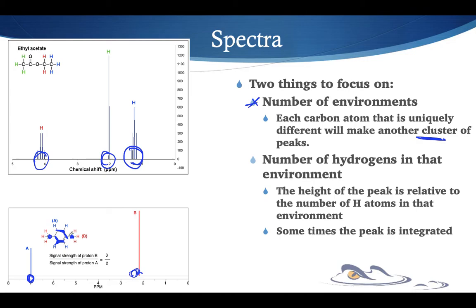Both of these are the same as each other, and that's why it results in just 1 peak rather than 2 different peaks, right? So this, we would say, only has 2 hydrogen environments, even though I have many places that hydrogen is bonded to, right?